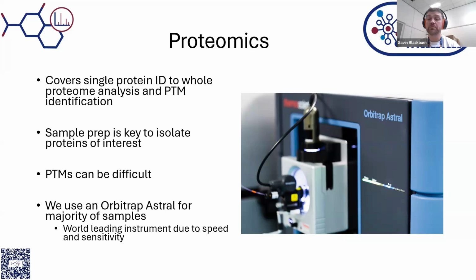PTMs can be difficult. Particular PTMs can require really complex sample prep. There are certain PTMs that pick up absolutely fine. There's certain PTMs that we will say, there's other people who can do that. We have a niche within these areas, even just in these small areas of biological mass spectrometry where we are experts. The chances are if you come to me and I can't do it, I know the person who is going to be able to do that for you.